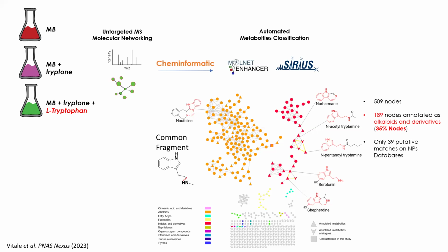Through the feature-based molecular networking, we found that the common fragment among all of those was this one, a tryptamine moiety, and we were able to isolate for the first time these metabolites, and the first metabolites from this strain.